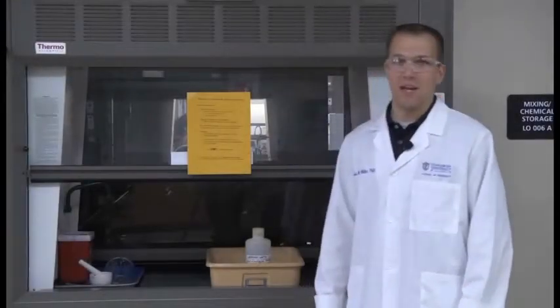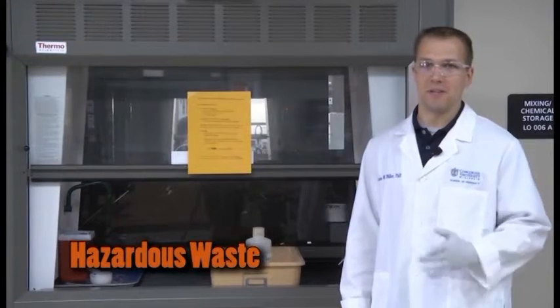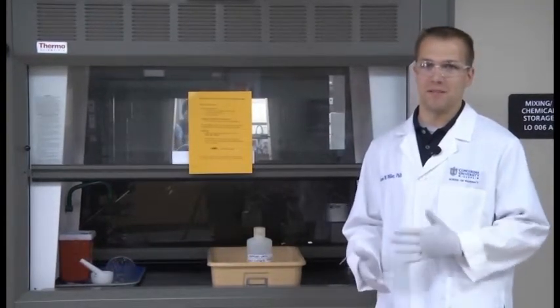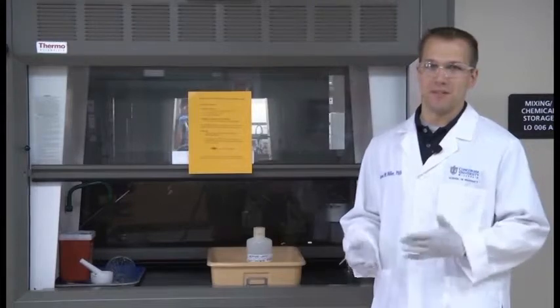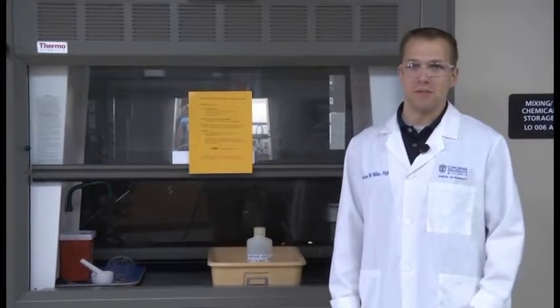A situation that commonly comes up in the lab is that we have some sort of waste chemical at the end of whatever experiment we're doing. And this could also happen in something like a maintenance area if you're using a chemical for cleaning and you have this waste product at the end of the day. And you might ask, what do I need to do with this? Is this something that can go down the drain, can go into the regular trash, or do I need to dispose of this in a different way?